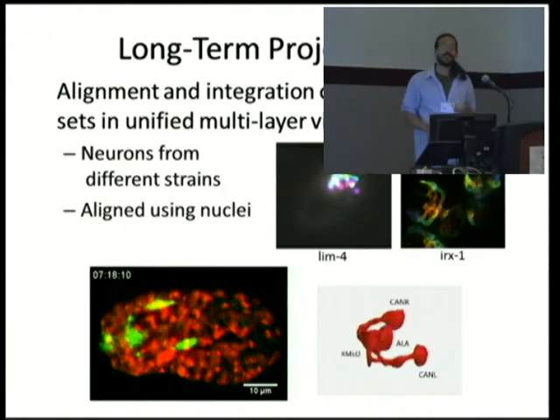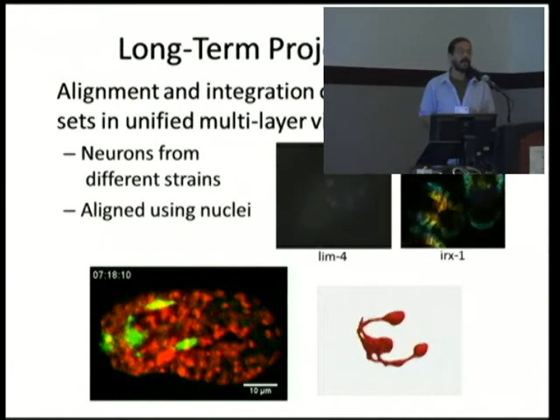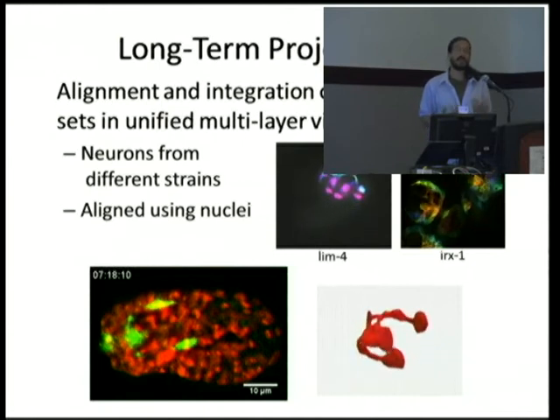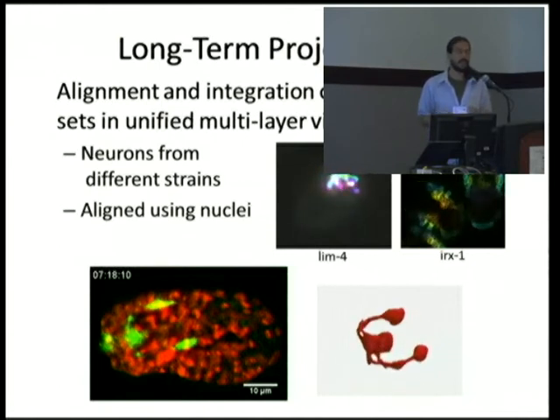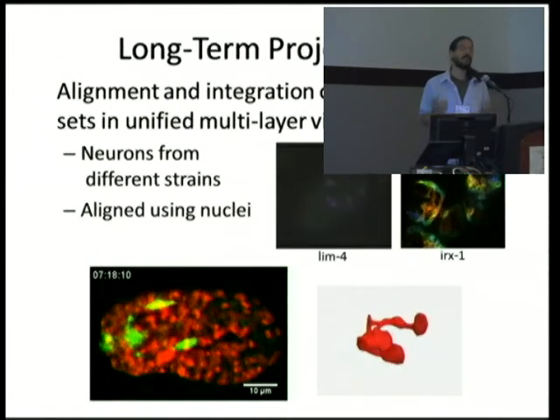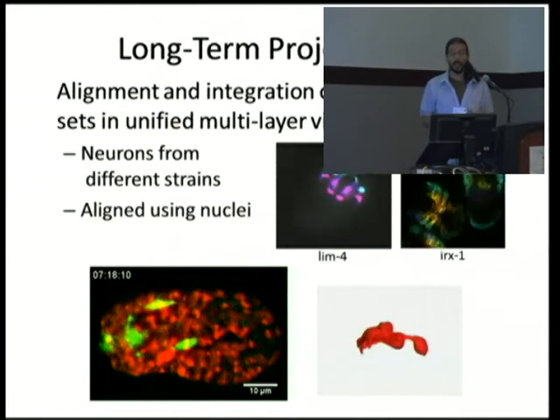But what's actually more interesting to me, as someone whose background is in graphics, is what are the right paradigms for trying to explore the data and be able to extract useful information from these really complicated scenes. Even in the abstract form, 300-odd neurons among 600-odd cells, it's a lot of stuff going on, and it is kind of complicated to navigate.